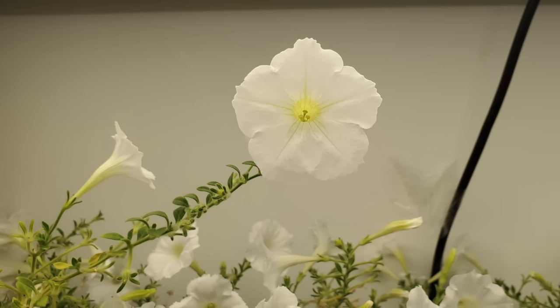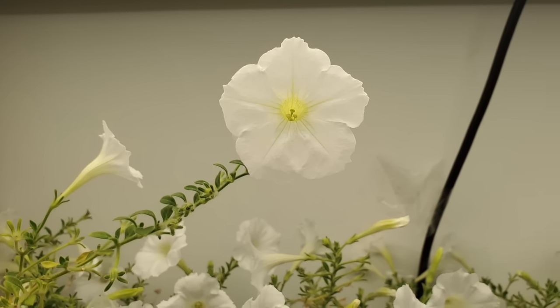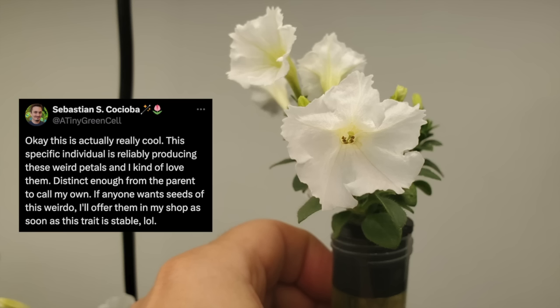It doesn't need to be open air pollinated. And if it's a transgenic, you absolutely can't do that, right? So anything transgenic can't leave my laboratory. But within the confines of my lab, I'm the selection pressure, right? So I choose which one I want to keep, and my main interest is in shape. So there are certain genes that get turned on at very particular points during the development of a plant, of a flower, that then beget its shape.